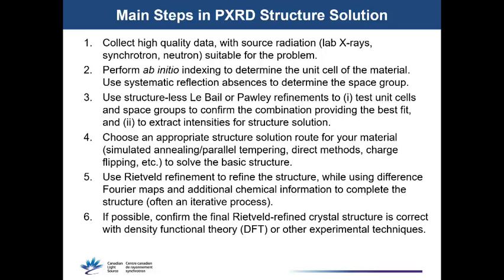You have to index the data to determine your unit cell and your space group. This often blends into the next step, because using structureless refinements like Le Bail and Pawley refinements, which Bob discussed this morning, can be very important for testing your unit cell and space group combinations to make sure that you've got the optimal one.